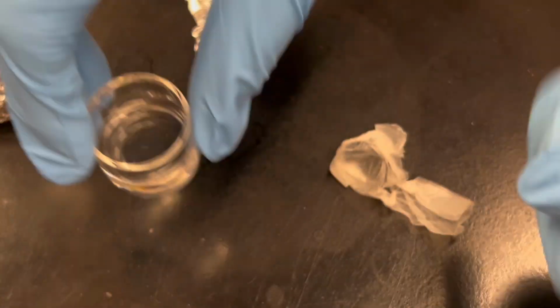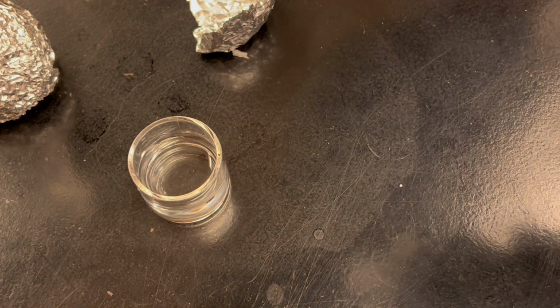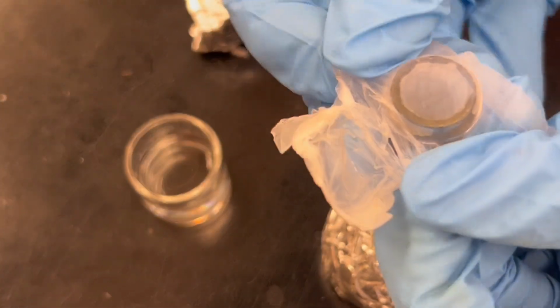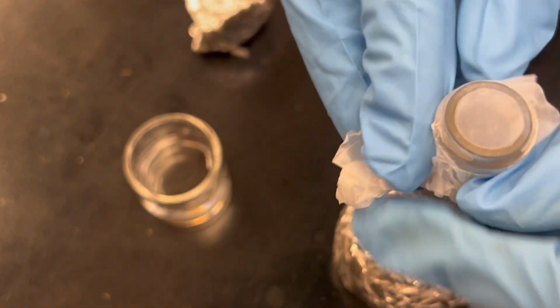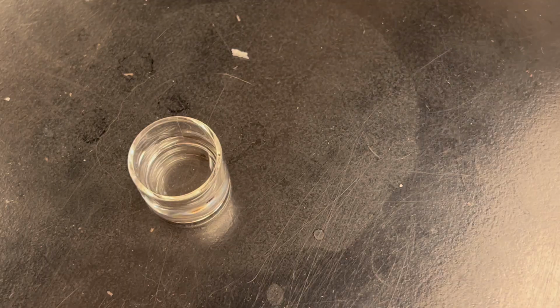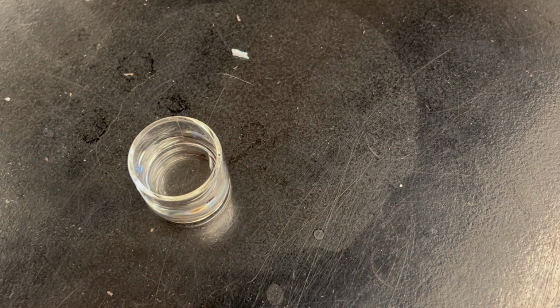And another important point is we could observe the solution. If it turns yellow, then it means the OPD got oxidized, and it is not very useful for our experiment. But we could see this is very transparent and it does not change color.